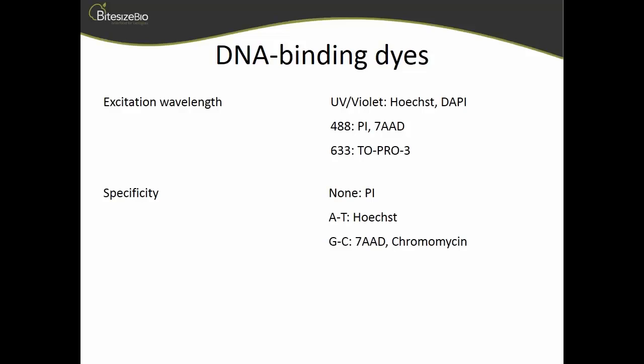It may also depend on what you want to do with your cells. Do you need to keep your cells alive afterwards? The list I showed you on the previous slide, most of those dyes, in order to bind to DNA, require the cells to be permeable, either by fixation or by some sort of permeabilization agent, and therefore pretty much non-viable. So although you can analyze the DNA, you can't do too much with the cells afterwards. Of course, sometimes that's exactly what you want to do.